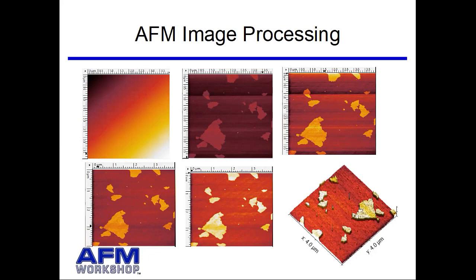And again, the thing you have to remember about these microscopes is this is 4,000 nanometers across here, and this height is like 3 nanometers. So you're getting extremely high contrast on this sample. All right, so that's how you might process an image if what you care about is visualization, if you want to show somebody a nice picture of what you have on your surface.